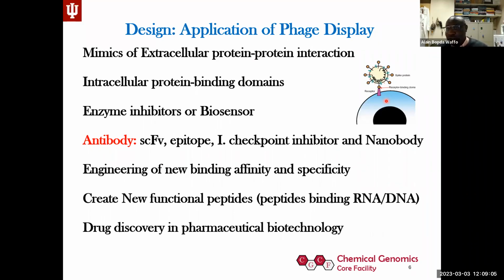For cell-to-cell interaction through protein, or microbes interacting with the cell, we can map the major domains of those proteins. One other thing, we know enzymes will have some cleft, their active portion or the allosteric portion. We can map peptides binding those portions with the technology we have. At the same time, I will talk about biosensors, maybe with the time. We can also try to target some of the key proteins.